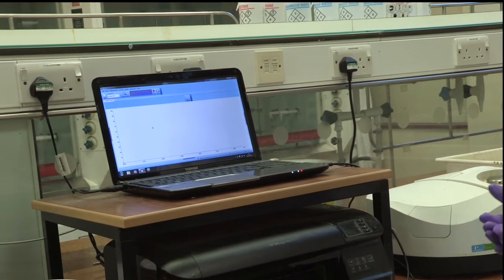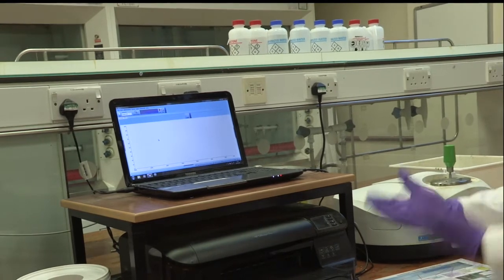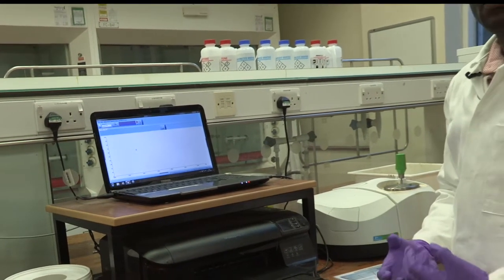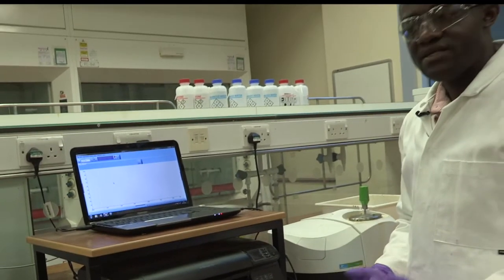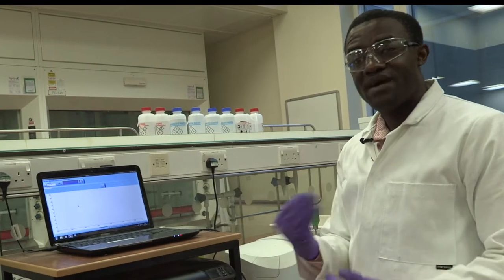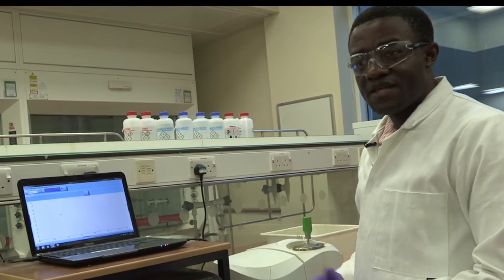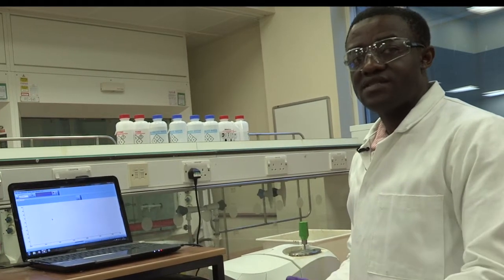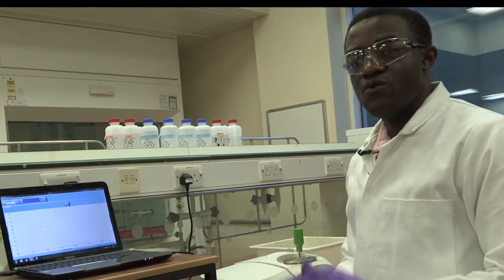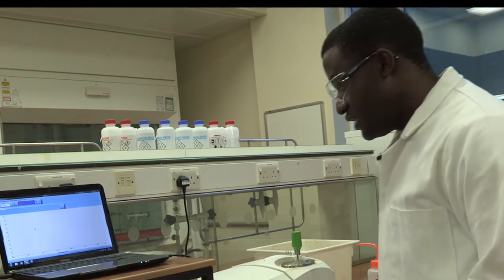After that, you can run the measurement of your real sample. What the machine does is that it picks up a new absorption when you are running your measurement, and then that absorption is also going to include the background that the machine had measured previously. So it subtracts that background which you've measured and then gives you back what the actual absorption of your sample truly is.